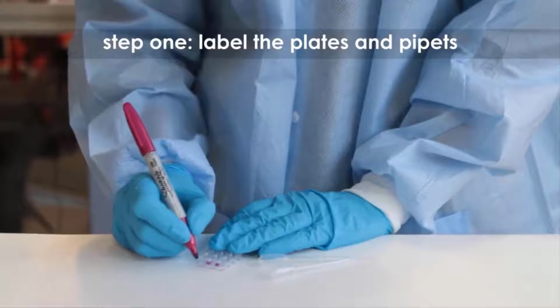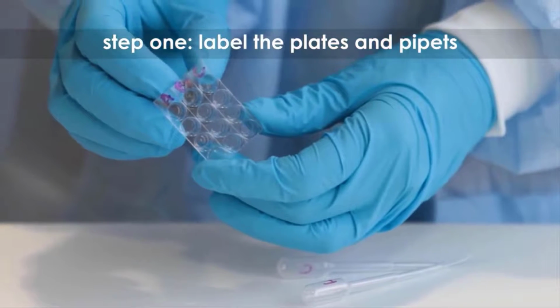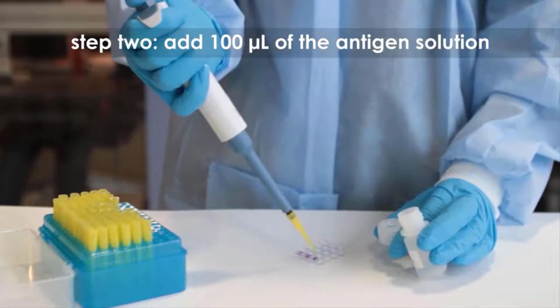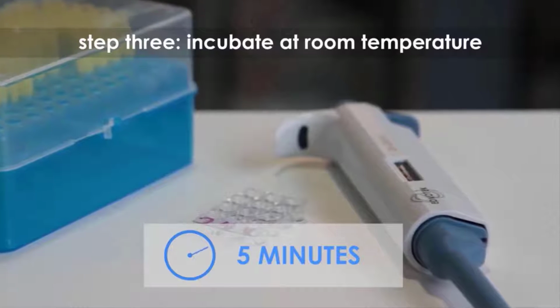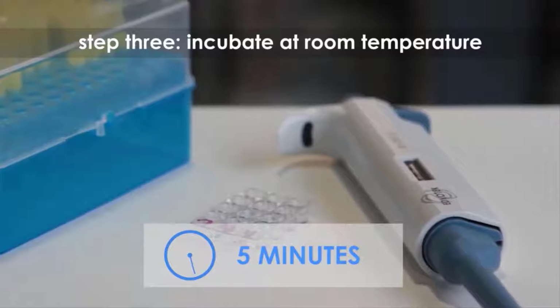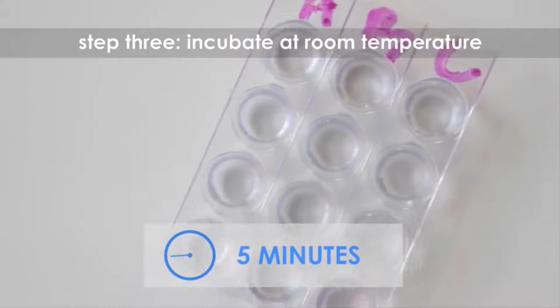Label the microtiter plate and transfer pipettes as noted in the product literature. Step 2. Add 100 microliters of the antigen solution to all of the wells. Step 3. Incubate for 5 minutes at room temperature. At this time, the antigens will non-specifically adhere to the plastic through hydrophobic and electrostatic interactions.